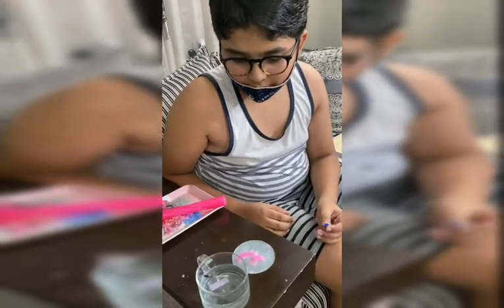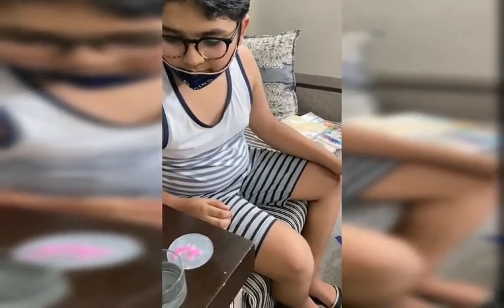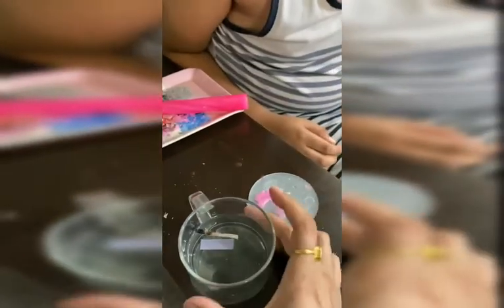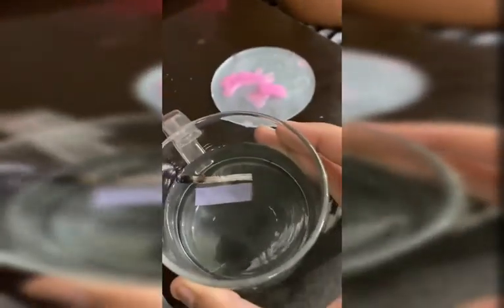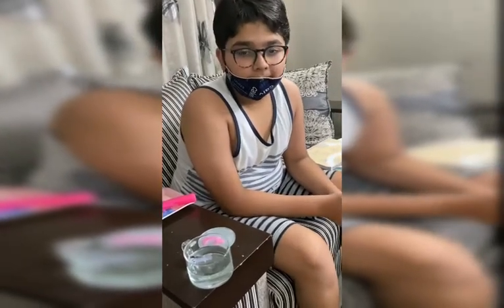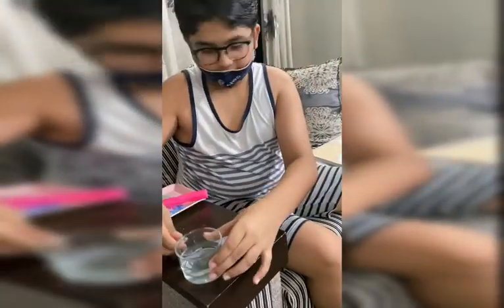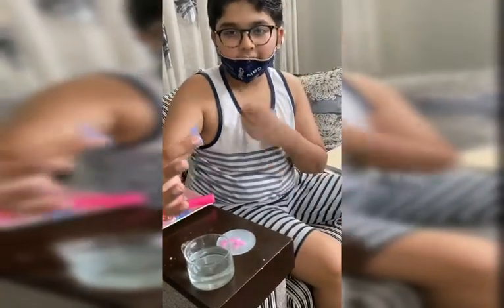Is the color changing? Not now, but it will take some time. I think its color has started changing — yes, it's turning blue! So what is the meaning of it? It's basic in nature. Can you pick it up and show? See, it turns blue.